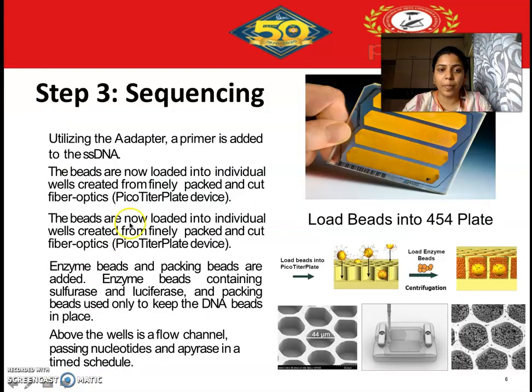Okay, so next step is sequencing. We saw the use of the B adapter, and now you have the A adapter. Utilizing this A adapter, a primer is going to be added to this single stranded DNA. The beads are now loaded into individual wells, created from finely packed and cut fiber optics. So the beads that we have got from step two form a kind of library.